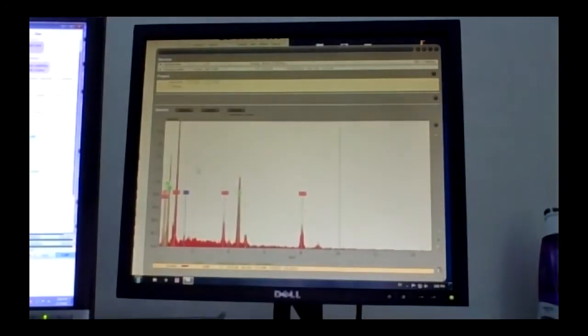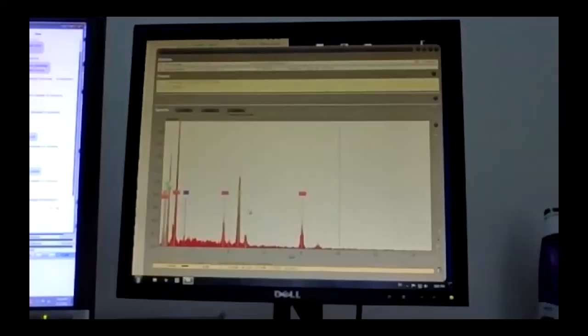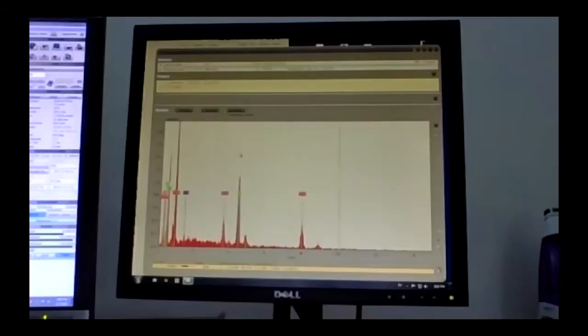So, did you see the spectra? No, we haven't seen the spectra. Okay, so only as I was scanning the sample. Did you see the sample before? Yeah, when I was sharing the screen here, we saw half of the sample and then it froze. Okay.